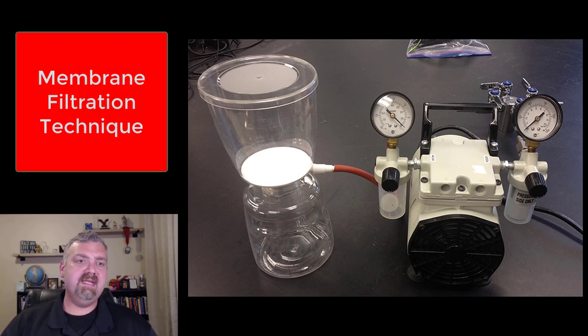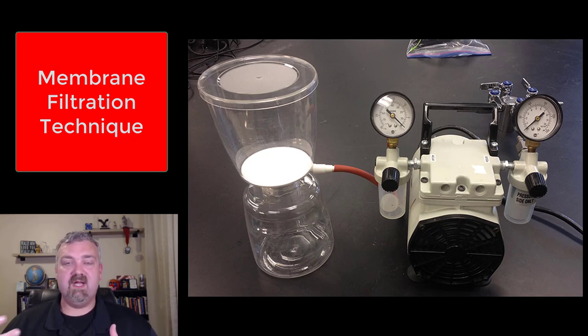Last one I am going to show you here is called the membrane filtration technique. This would be what you would do if a sample was pretty dilute, like let's say when we look at pond water and you wouldn't have a massive amount of microorganisms in a small sample. So we need to actually concentrate it. Most of the time we have to dilute our samples to work with them and use serial dilutions, but sometimes you have to actually concentrate your sample before you can use it.